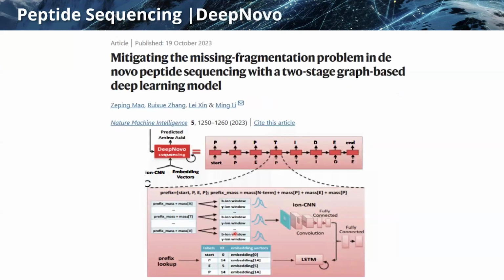Now, the deep learning algorithm uses prediction models to predict the sequence and then match it to the MS2 spectrum given the fragmentations and intensities. So instead of finding the best path, here the developers talk about a translation problem in terms of how well our model can predict each fragment or fragments that would occur in MS2 for the given peptide sequence.